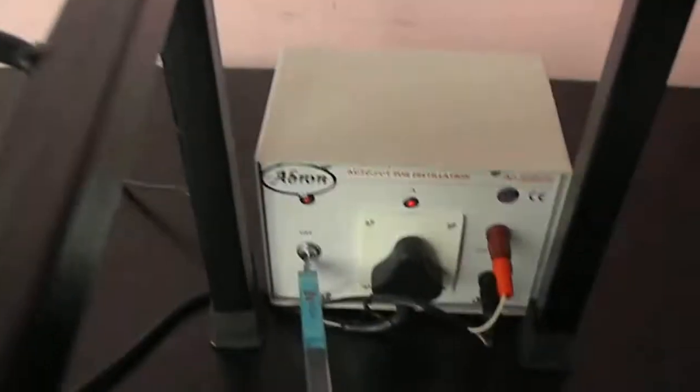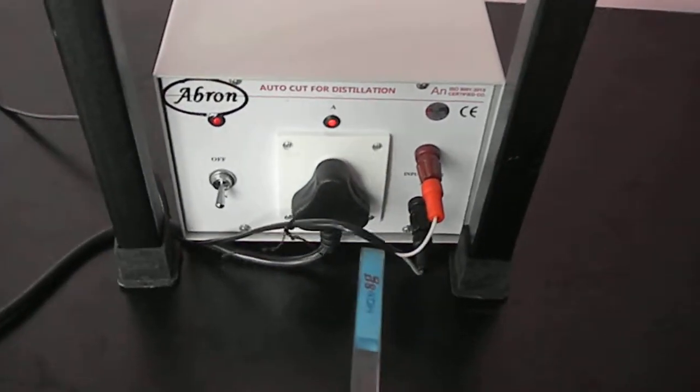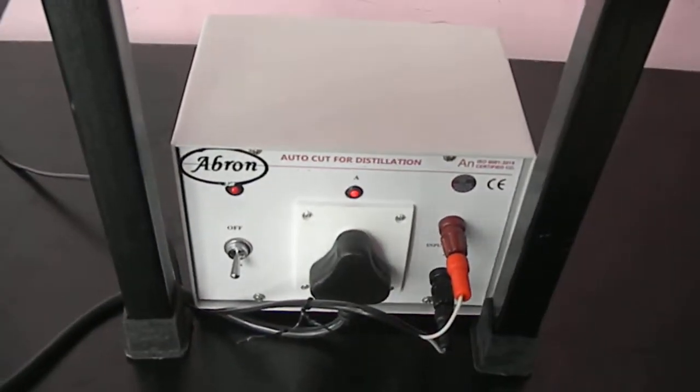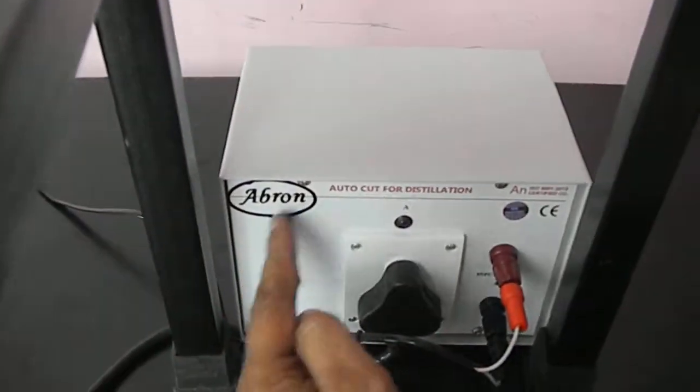The auto cut-off has one switch which is an on-off switch for this heater. This probe goes in and automatically this indicator will activate. Now if you switch it off, this completely switches off.